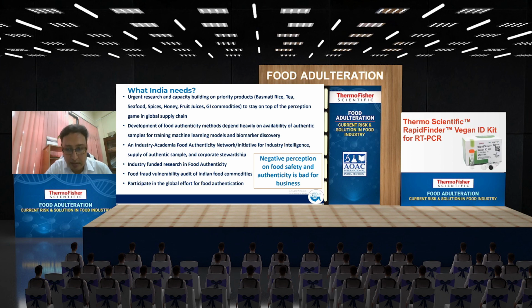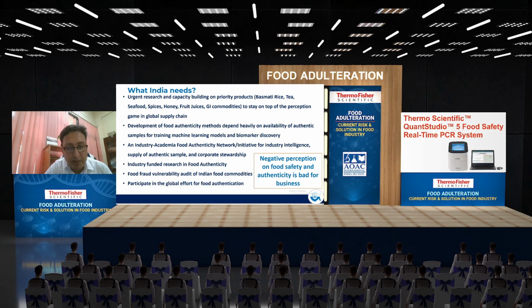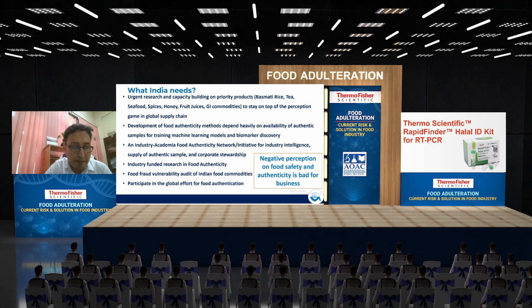IRMS can be a confirmatory method, especially when geographical origin is the question, where DNA-based methods don't help much. Then you have mass spectrometry and NMR. These chemical techniques can answer questions where DNA-based techniques don't help much, like differentiation between wild-caught and farmed of the same species, or differentiation of the geographical origin, such things.